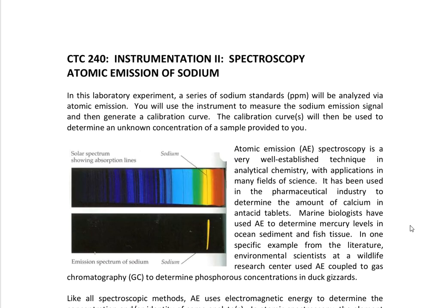But in this particular lab experiment, it's not really sample processing. It's just really an introduction to how atomic emission works. That's really all that it is. Very similar to the very first atomic absorption lab that we do, where we run copper standards and we run them at primary and secondary and tertiary wavelengths. There's no real sample, so to speak, that goes along with those types of labs. It is just the basics of understanding the instrument and how to set it up to do the emission part in this case, and not the absorption part.